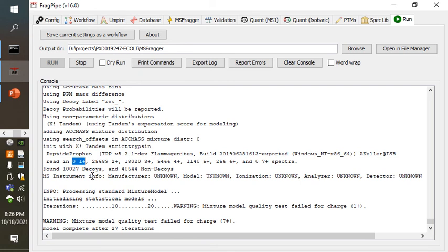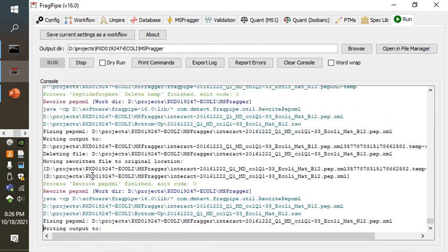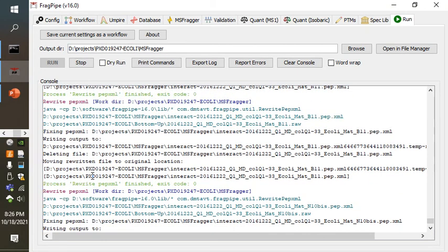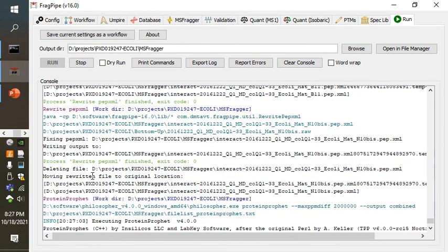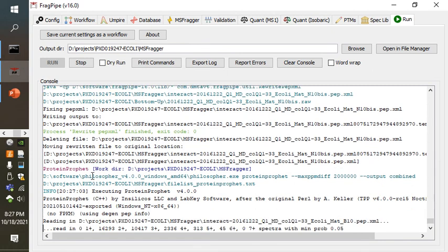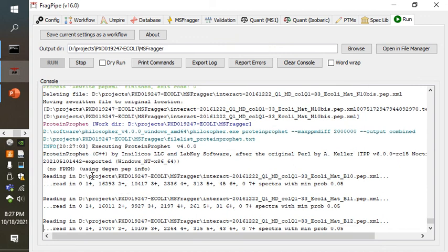Further, they say that if I am unable to determine what the charge state for a peptide ion is, I'm not going to collect the tandem mass spectrum for that either. So in practice, for bottom-up data from this class of instrument at least, we very rarely see a large number of +1 ions collected.